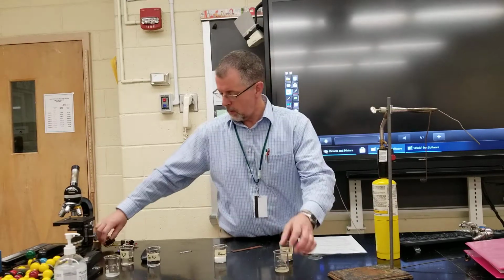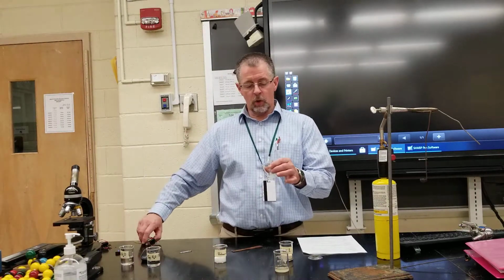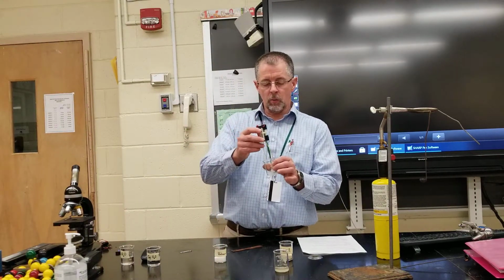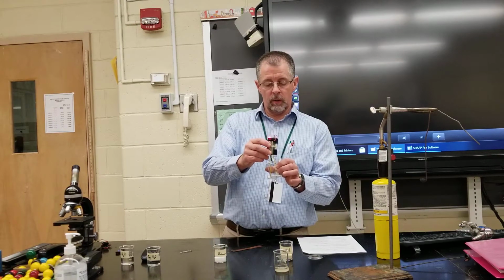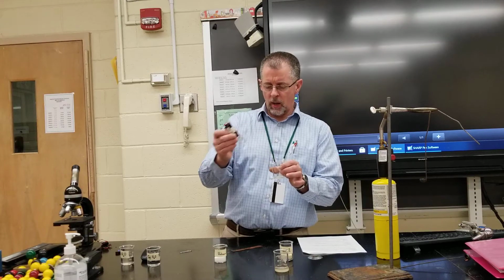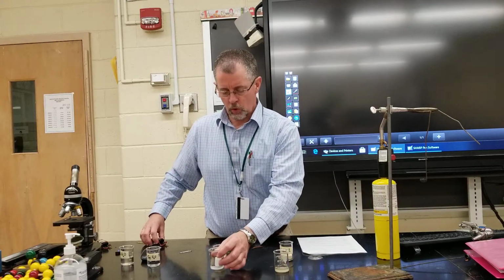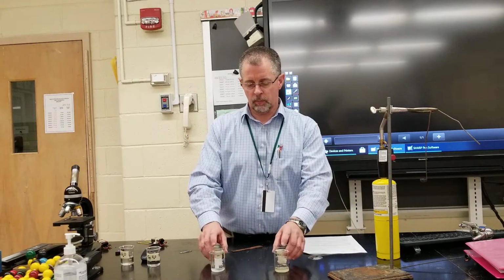Now I look at unknown number 2 and dissolved it again with deionized water, and I see this one lights up very brightly. So that shows me there are now free-floating ions in that deionized water. So when we dissolved number 2, number 2 produced ions.